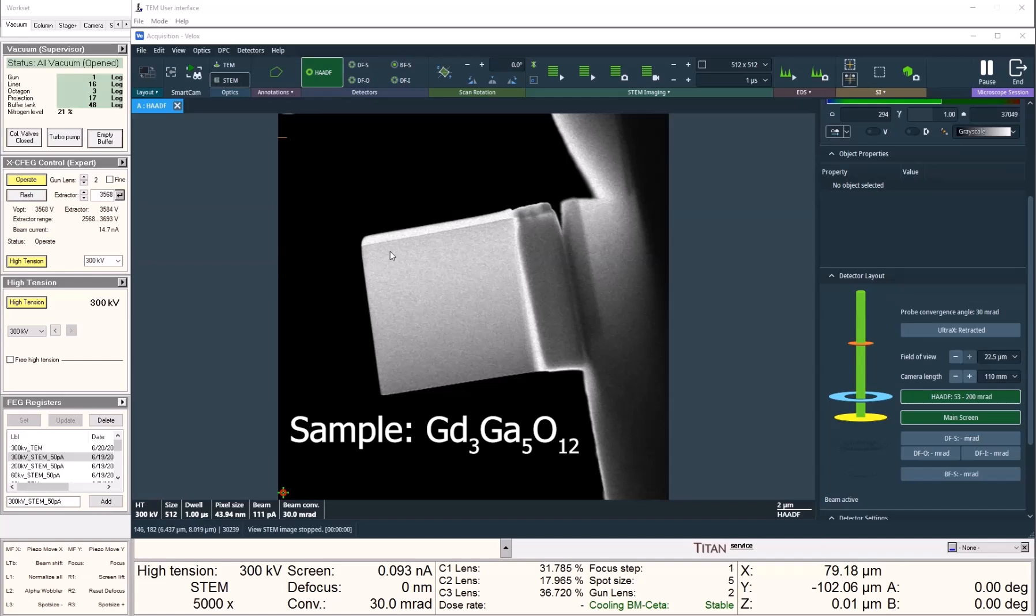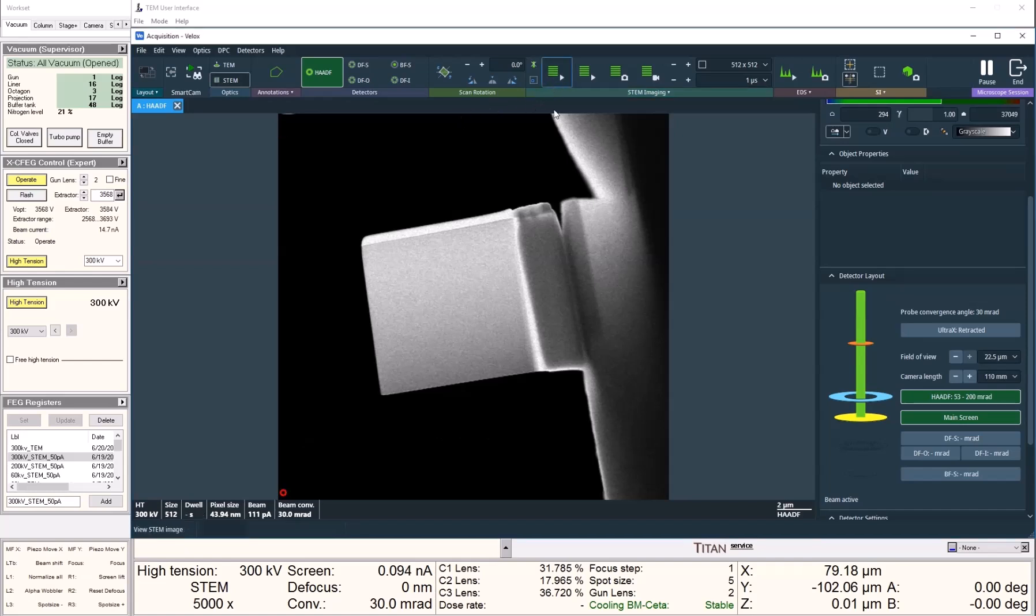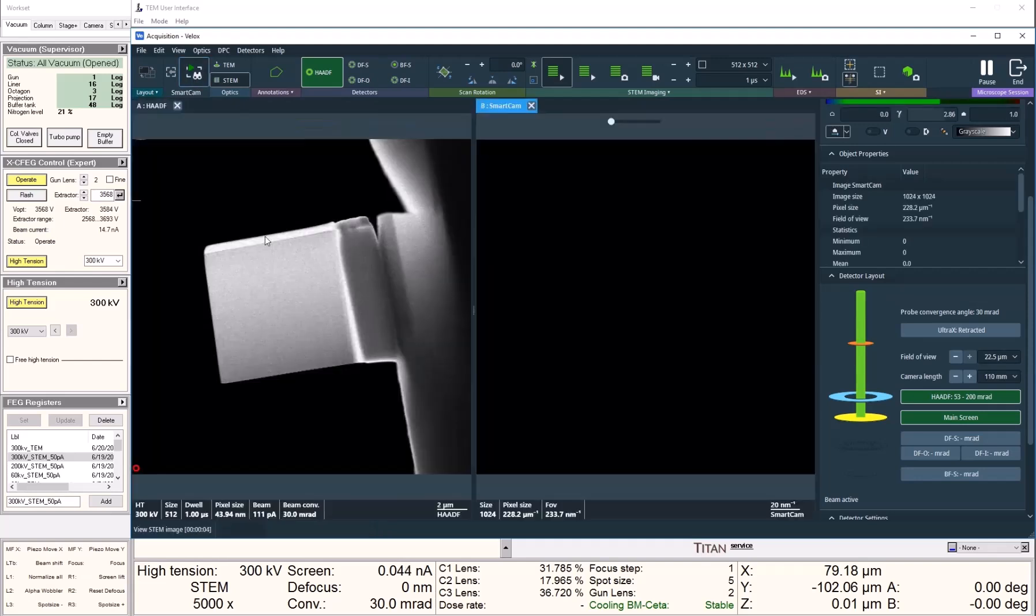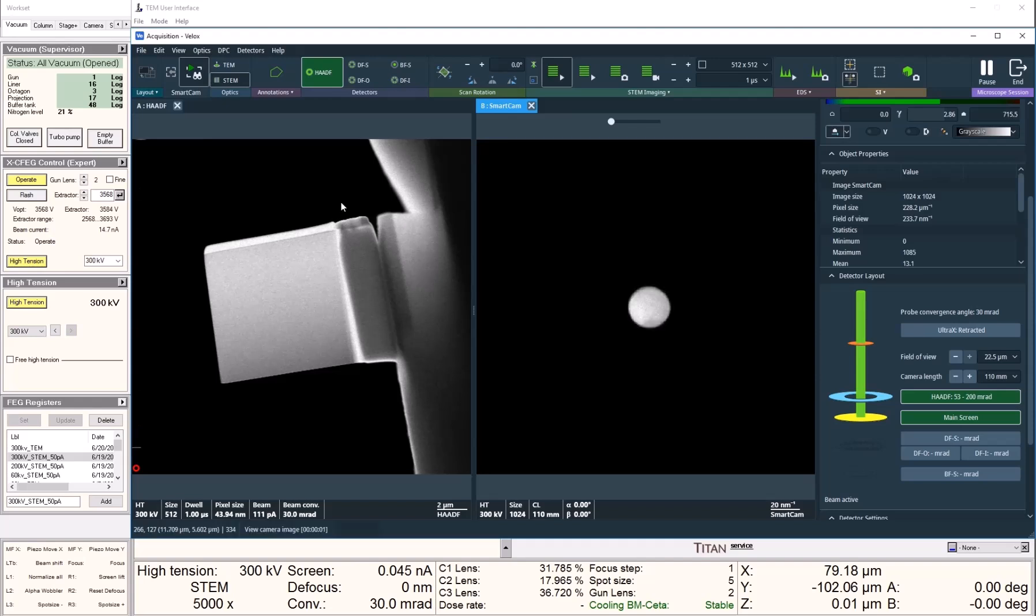What I have in the microscope is a gadolinium-gallium garnet sample prepared by a small dual beam. First, I would like to tilt the sample onto the 1-1-1 zone axis, and this can be done easily with our click-to-tilt function in VLOG.